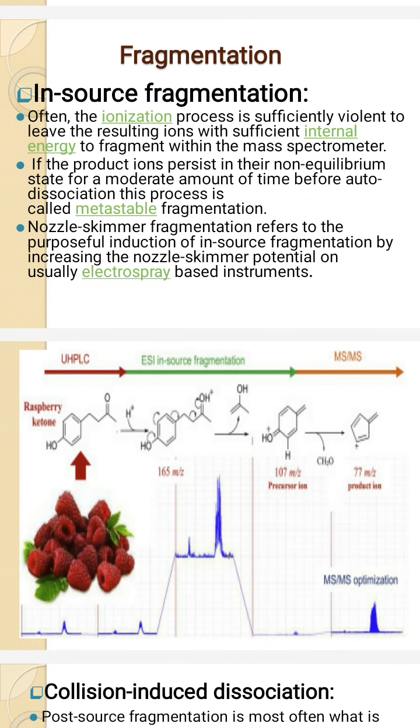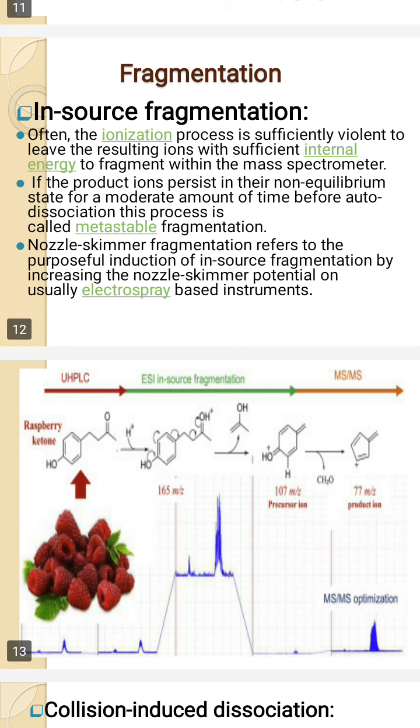Fragmentation. In MS, fragmentation is the dissociation of energetically unstable molecular ions formed from passing the molecule in the ionization chamber of a mass spectrometer. Fragmentation of gas phase ions is essential to TMS and occurs between different stages of mass analysis. There are many methods used to fragment the ions, and this can result in different types of fragmentation and thus different information about the structure and composition of the molecules.